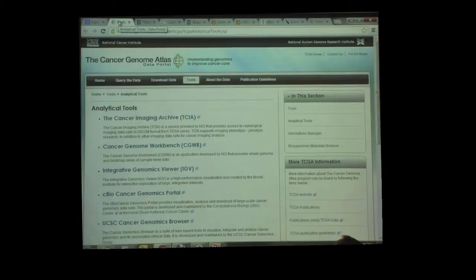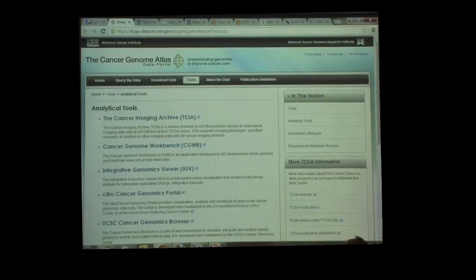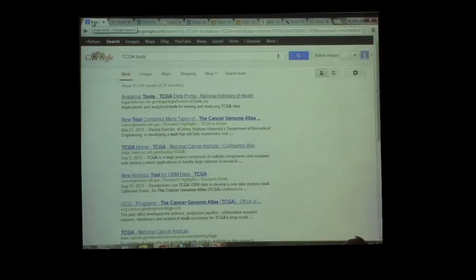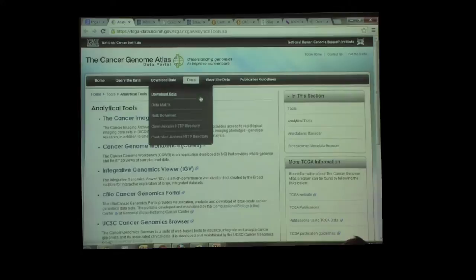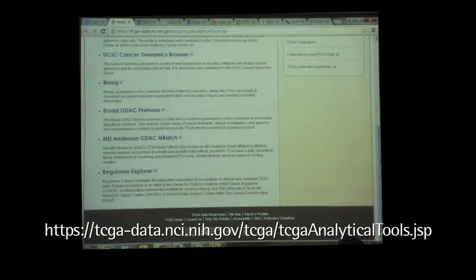There are a lot of tools available and I don't have time to go through all of them in detail. You go to Google, type in TCGA tools, and the first link that comes up — analytical tools — that's the TCGA page. When you get to the tools page, this is a list of existing tools that the GDACs have produced. We have produced a particular tool called MBatch, but I'll get to that in a bit.